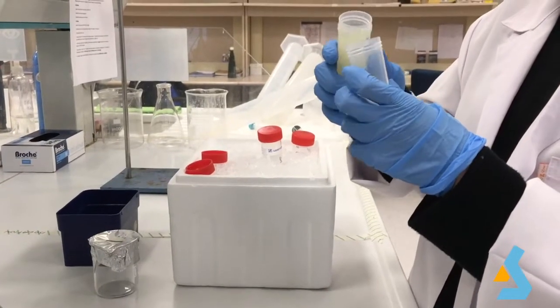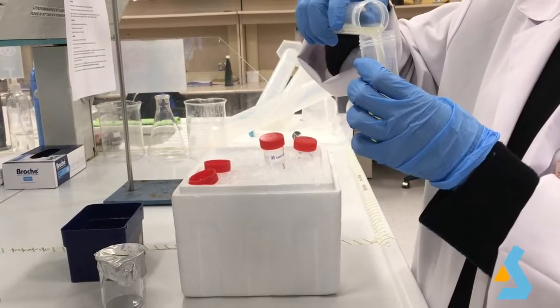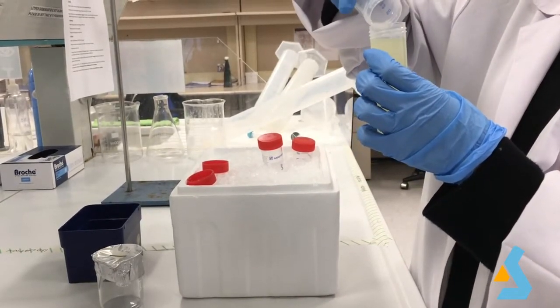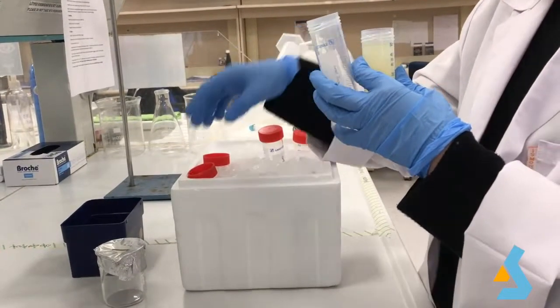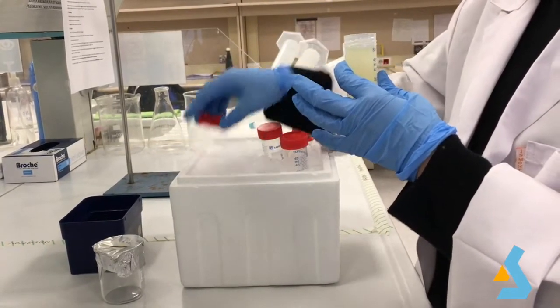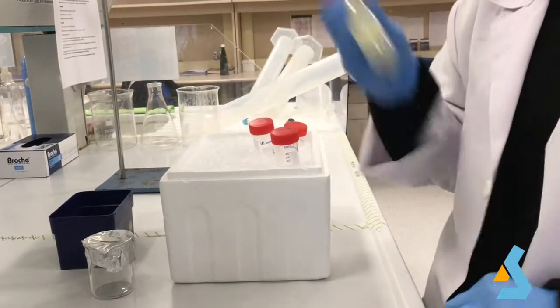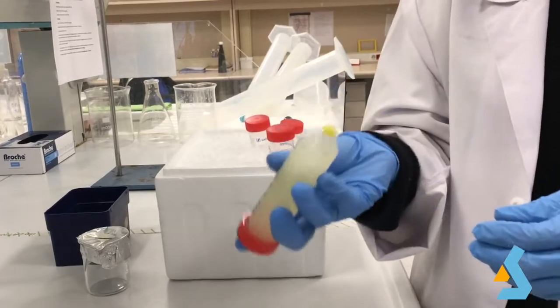We then transfer the same resuspension to other tubes in order to resuspend and recover the pellets in those other tubes. The lysis buffer contains salts, lysozyme, DTT, and PMSF. Lysozyme breaks peptidoglycan cell walls, DTT is used to prevent oxidation damage of the protein, and PMSF is used to prevent protease degradation.